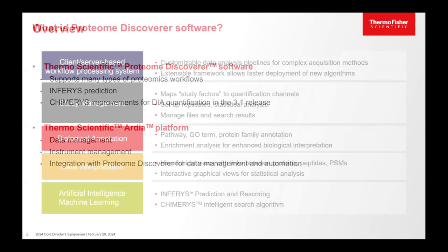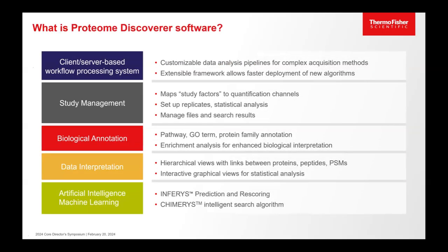So Proteome Discoverer software is actually a pretty substantial software package. It's been around for about 15 years. And the main reason for this software package, and the reason why it's developed its specific way, is to handle the very complex data that our instruments can produce. If you think about our Tribrids, they can do ETD, EThcD, CID, HCD, UVPD.